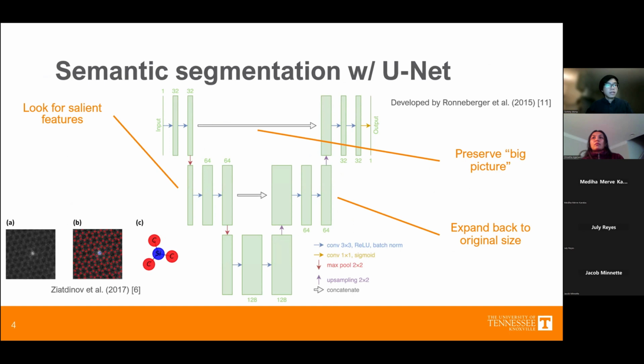It actually retains more information of the original image. Right. And therefore it gives a broader view of that image, so that they're basically different levels of feature extraction in the network.